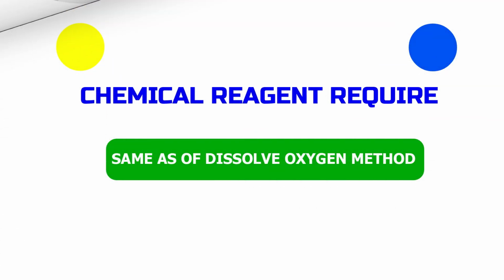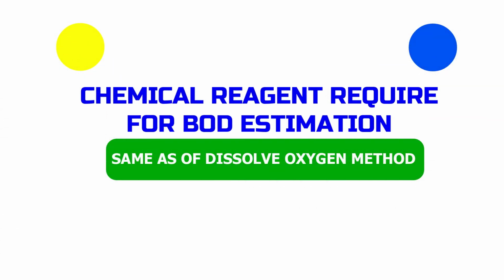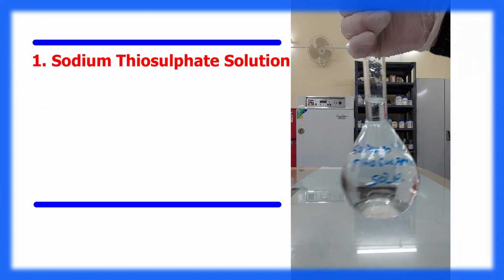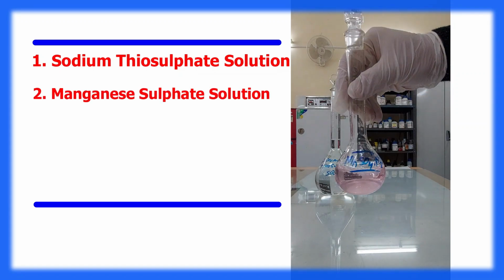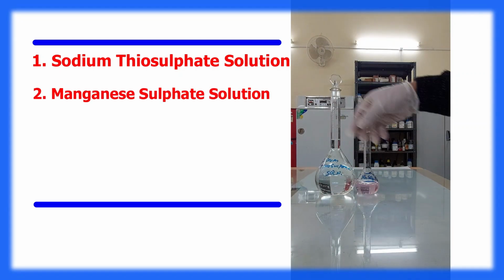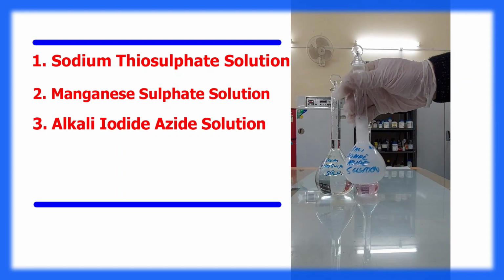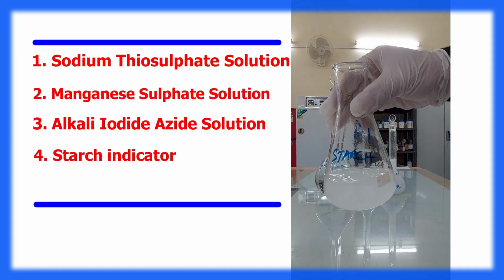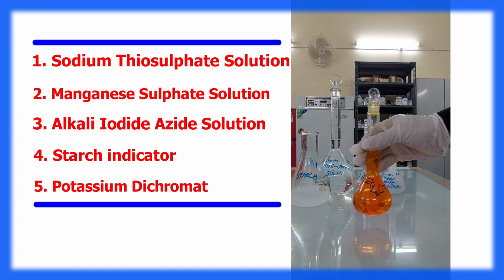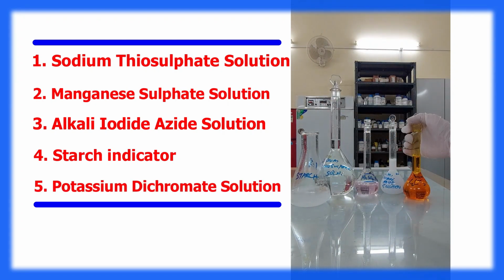Similarly, even the chemical reagents required are also the same, and the different reagents that will be used here are sodium thiosulfate solution, manganese sulfate solution, alkali azide iodide solution, starch solution, and potassium dichromate solution.